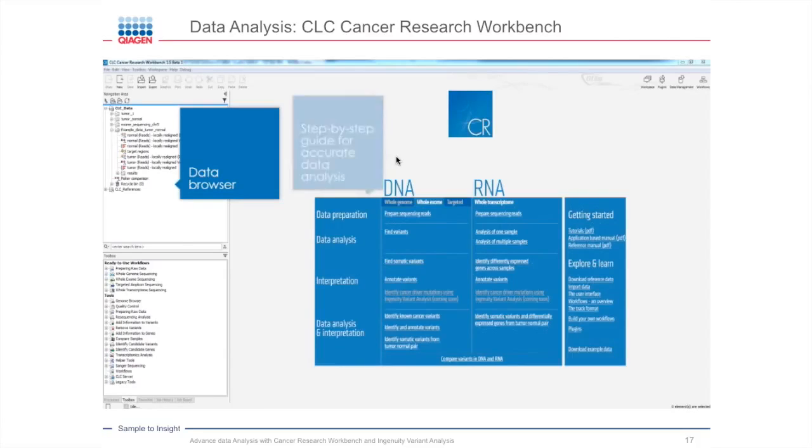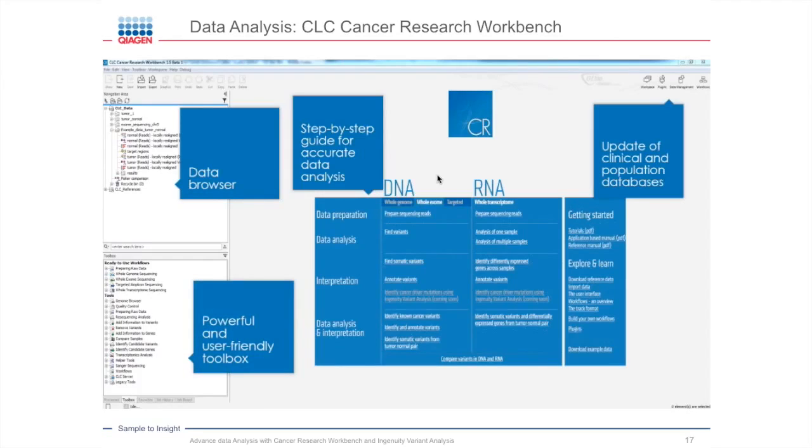What does the tool look like? When you log in to the CLC Cancer Workbench, this is how you will see it. As you can notice, right in the middle, you have ready-to-use information for you, whether you do DNA or RNA. Then you have the different steps.